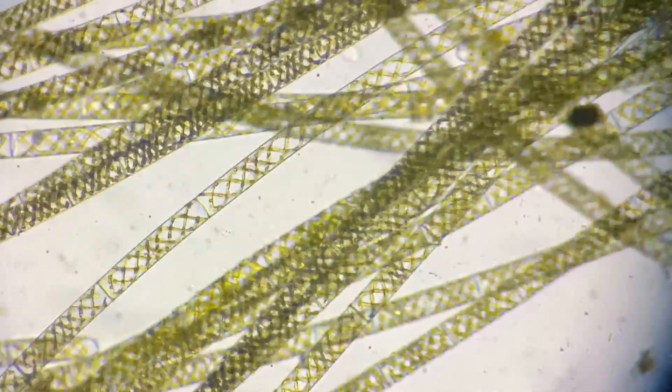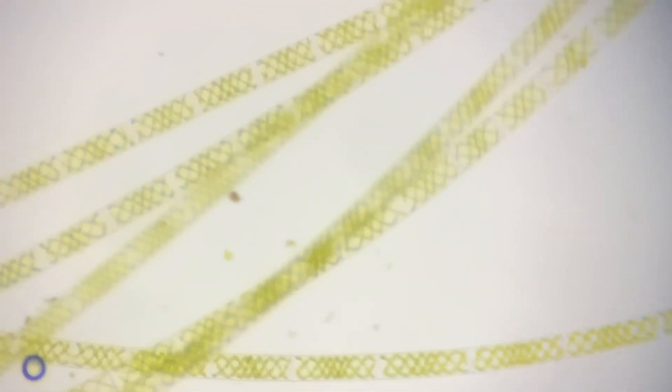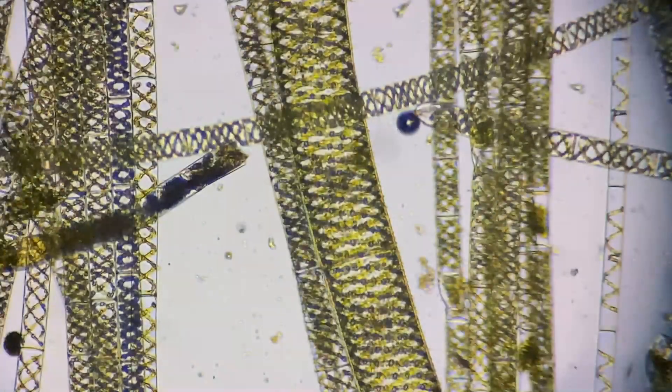I've got some filamentous algae — I think that's what this is called. This is on normal, so the aperture is all the way open. You can see these cool helical structures inside the cells, and the cells are in these long lines. They're super long and tangle up with each other. And there's something — some little rotifer! If you close down your aperture, everything comes more into view. That's your basic tool: open it up to see more color, close it down to see more detail.